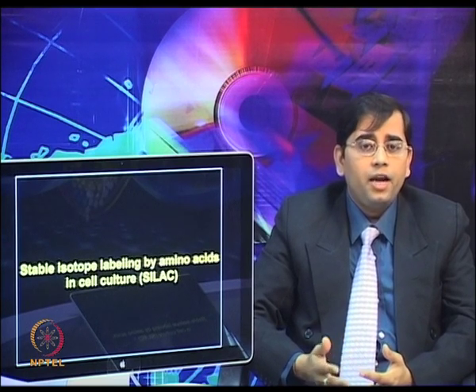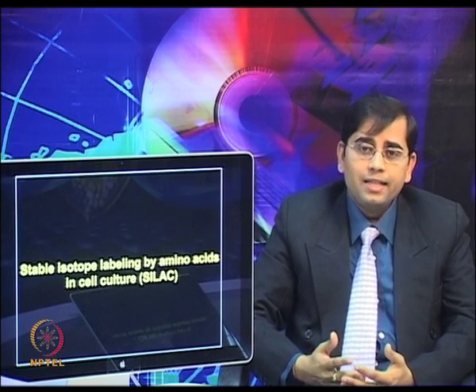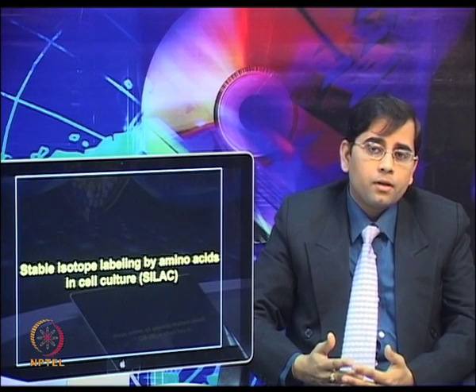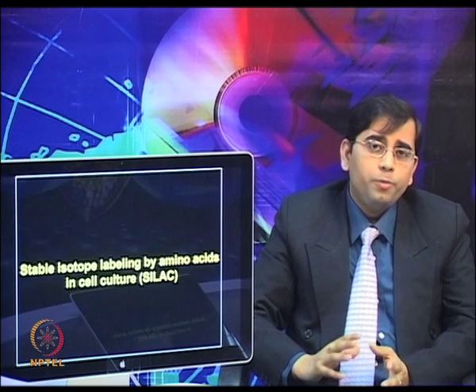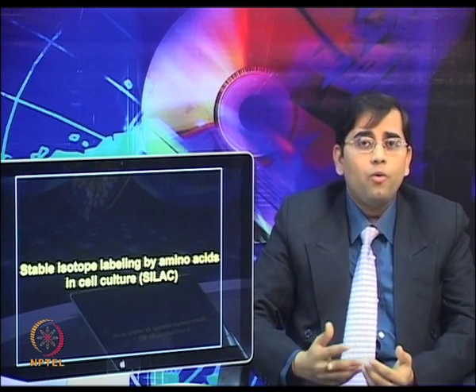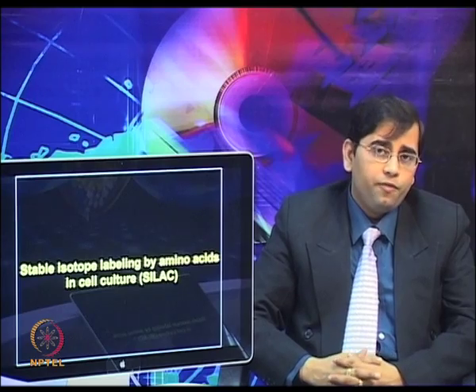Incorporation of the heavy amino acid occurs through the cell's own protein synthesis and turnover. The SILAC method allows for light and heavy proteomes to be differentiated by the mass spec while avoiding any chemical derivatization and associated purification.